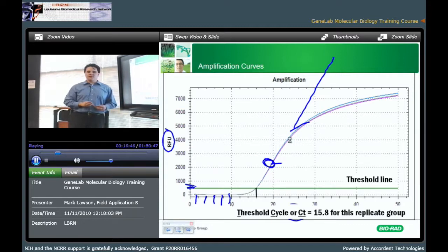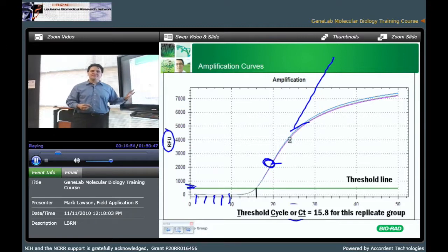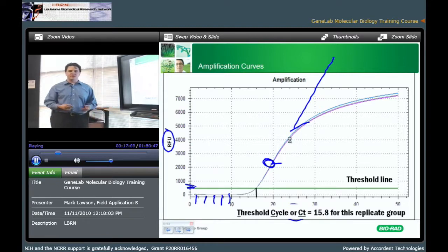All right? Part of what I'm going to be talking about today is MIQE. This is the new publication standard. Part of the MIQE standards means changing our terminology to something that is not company specific. And CQ was deemed to be neutral enough to be usable in any publication. So I prefer that you call it CQ. Those of us that have been doing this for a long time have a hard time changing over. So you have to catch me when I say CT.